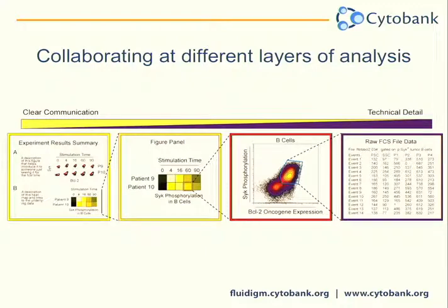And one initiative, for example, is there's a few people, for example, Nima Aghaeepour, who's in the Nolan lab, who has built an auto-gating tool. And what he's done is, and I think it's not in submission yet, but soon, I think he presented it this year at CYTO, where to help with sorting, once you've done your large CyTOF experiment and you want to sort a specific type of cells, you can actually develop a gating strategy. And he writes those to Gating-ML using R, and then I import those into Cytobank onto existing data sets. And so a lot of these collaborations, oh yeah, this is work with Aaron as well. He's nodding, he's like, I've seen those gates.